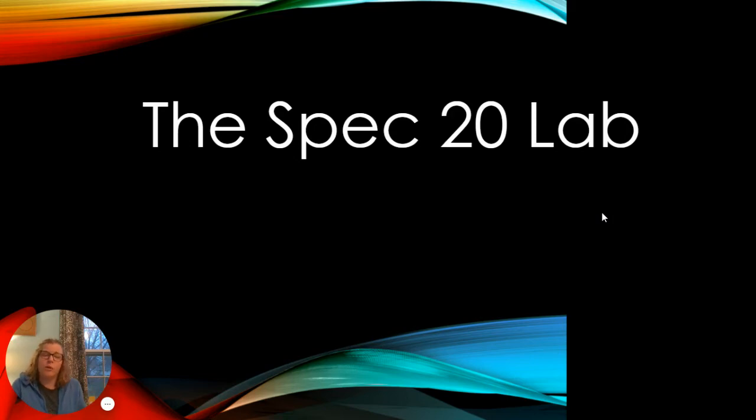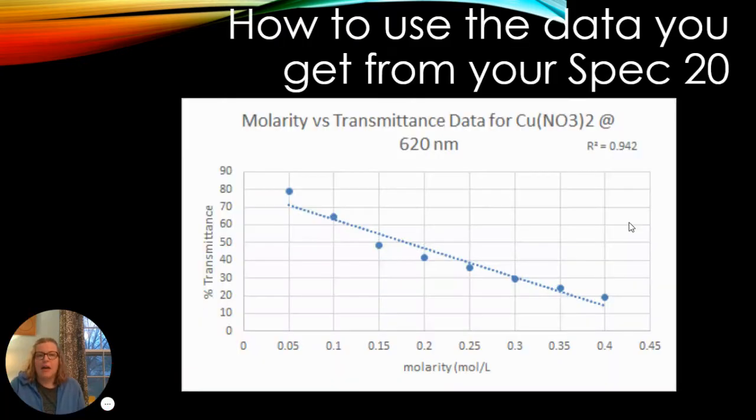Hey everybody, I wanted to go over with you a little bit more in depth the data analysis component of the Spec 20 lab, now that you have gone through and collected some of the data through the simulation and actually made the graphs and seen what they look like. So I want to show you how we can use those graphs to actually calculate some things about our solutions that we run tests on.